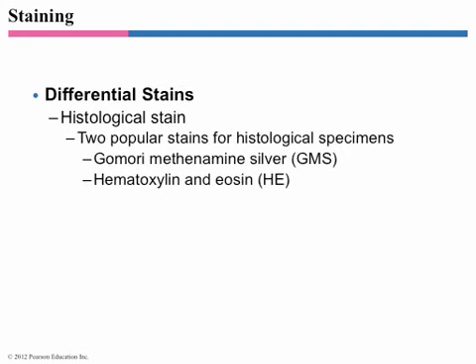So there's basically two general classifications of stains. Stains can be simple or differential. A simple stain is when you just want to look at something. You want to stain everything the same color. I want to look at cells. I'm going to stain all the cells purple. A differential stain always has two or more stains and is specifically for the purpose of being able to distinguish between two different things. The classic differential stain is the Gram stain. You guys should all be familiar with the Gram stain, whether or not you're taking lab. I'm not going to get too detailed into it. If you're not taking lab and you don't know what a Gram stain is, look it up.